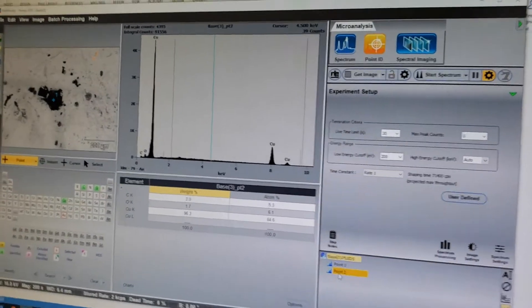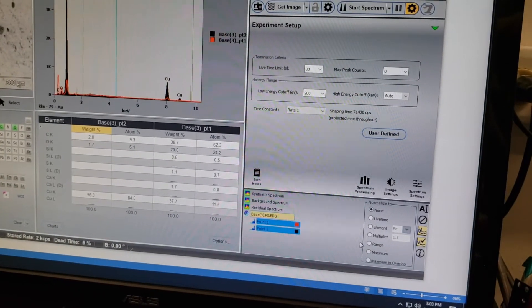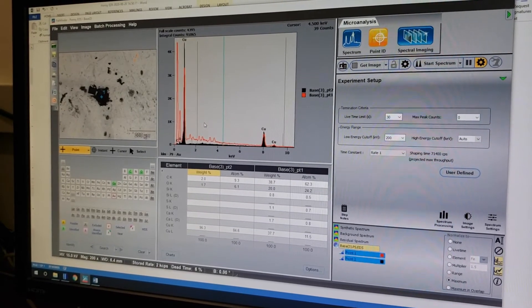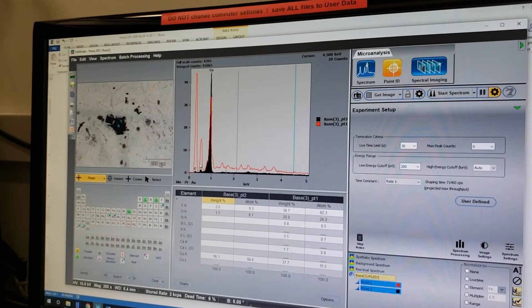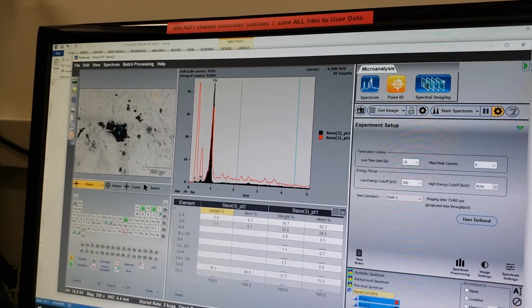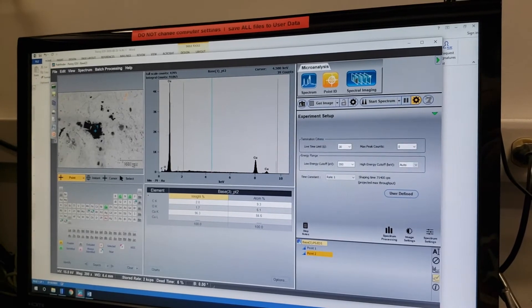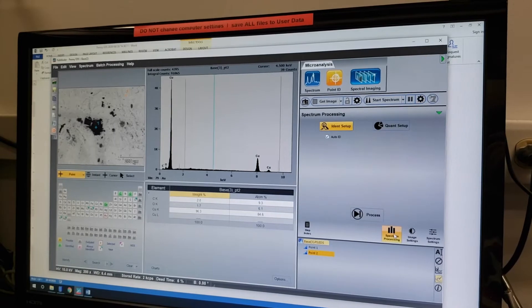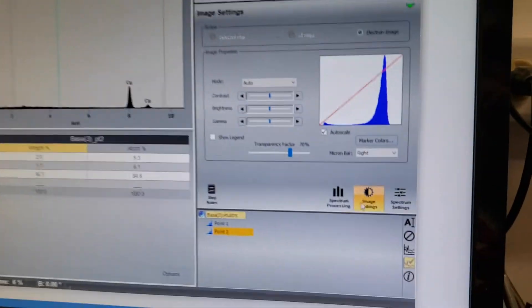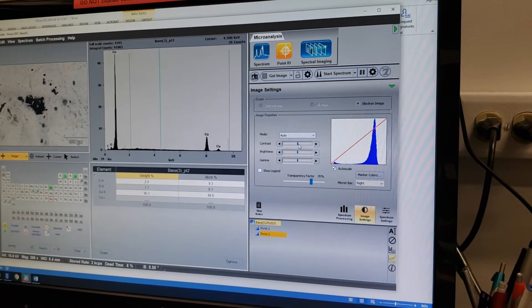We can also look at Point 2. If we wanted to, we could compare them by clicking the Compare button, selecting Points 1 and 2, and normalizing them so they have the same maximum. You can see there is a pretty big difference between the elements we're seeing at the two locations.